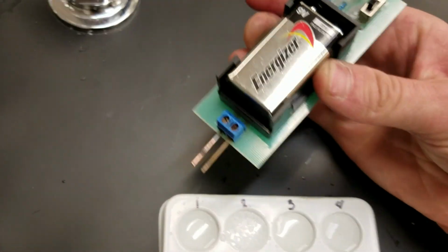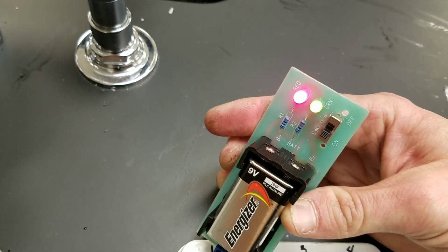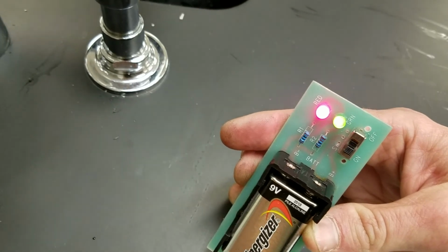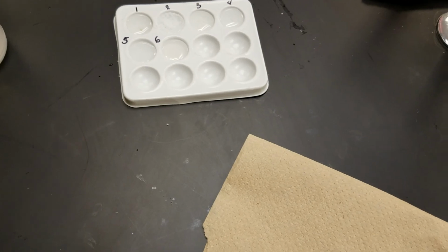Number 1, both of them are quite bright. So number 1, calcium chloride, has very good conductivity. I'm going to dry off my leads, make sure I'm not, for lack of a better word, cross-contaminating things.